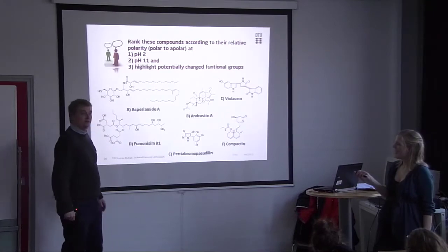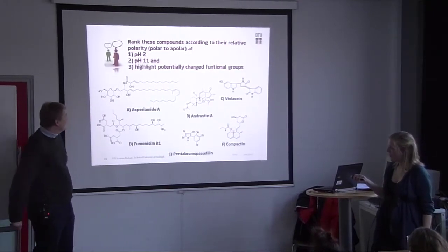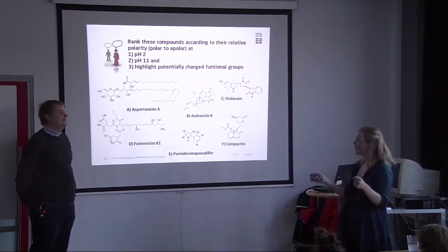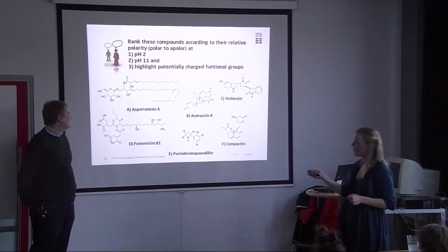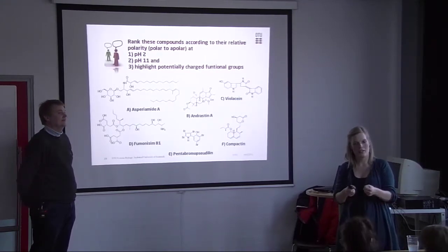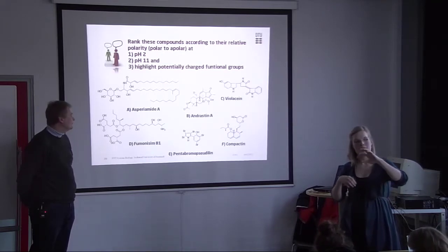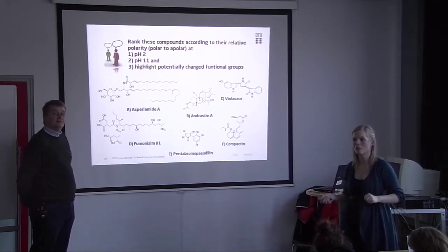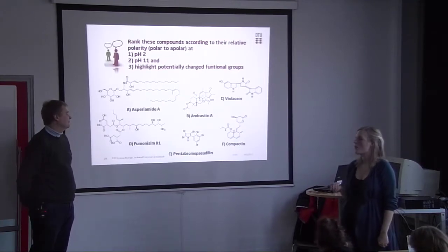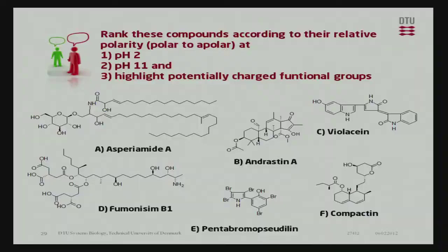Yeah. And the point is that even though you got that aliphatic part here in the middle, when you actually see the molecule, you can see that the TCA groups, the tricarboxylic acid chains sitting out here, can fold in and cover that part of the molecule. So when I talked about 2D structures and 3D structures, this compound will fold up and be even more polar in the 3D structure. So this is the other end of the scale.